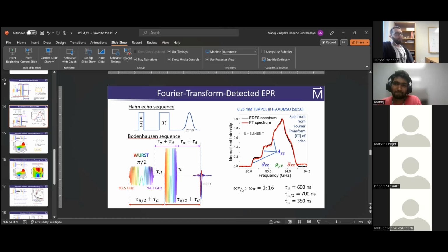And if you were to do a square pulse, the shortest possible, what's the maximum bandwidth you can reach, or the shortest pulse you can have? I think there is some limitation of the ramping of the power. I have no idea, but what's the shortest? In some of the experiments, I have used really short pulses.